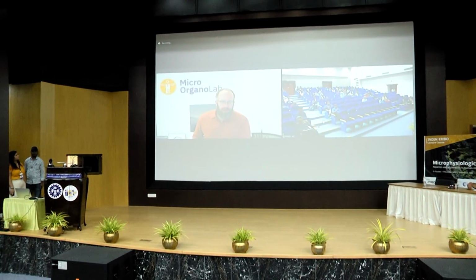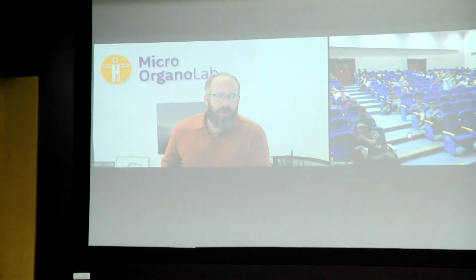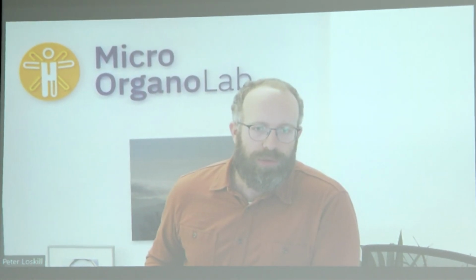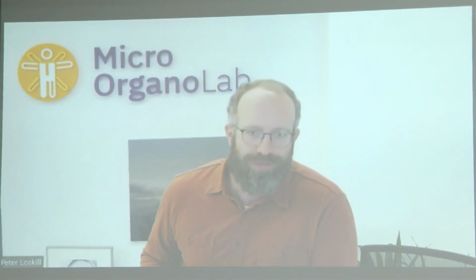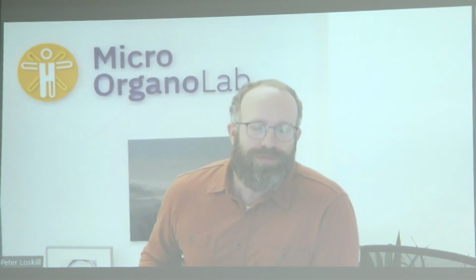Not yet. So we are working on a spin-out based on this organ disc, because we think that's a platform technology where a lot of different organ on a chip approaches could be put and transferred to. So it will hopefully be available as a commercial product soonish.